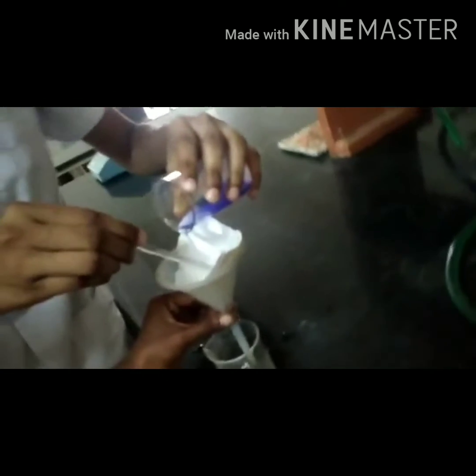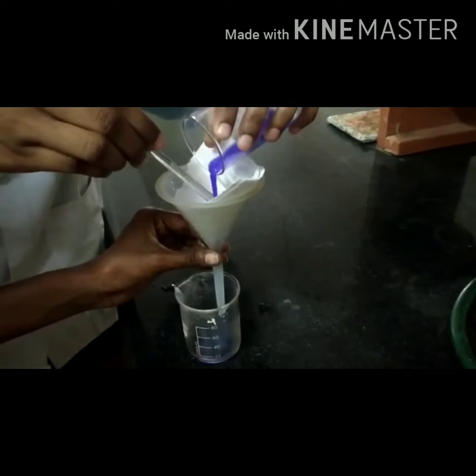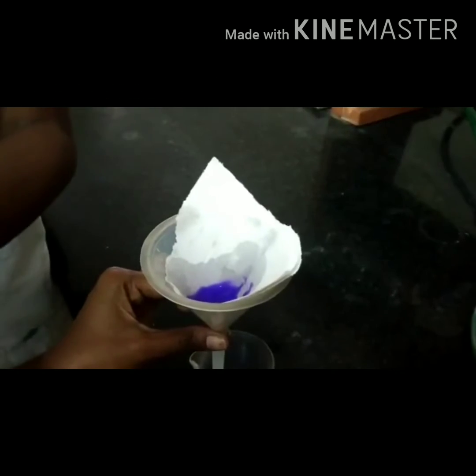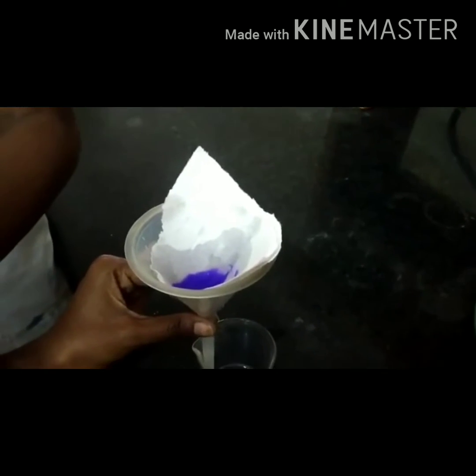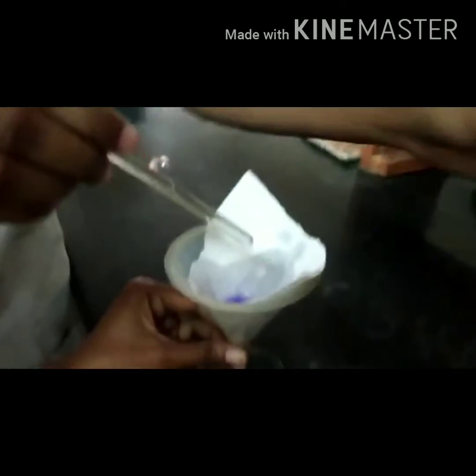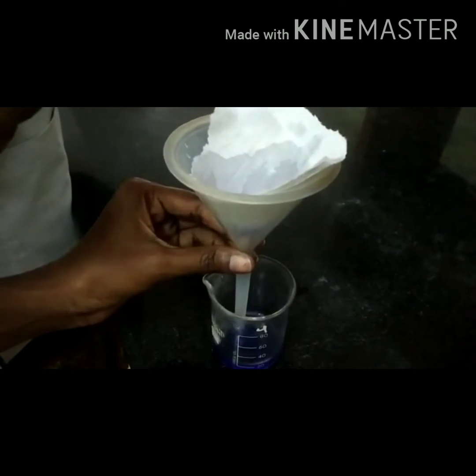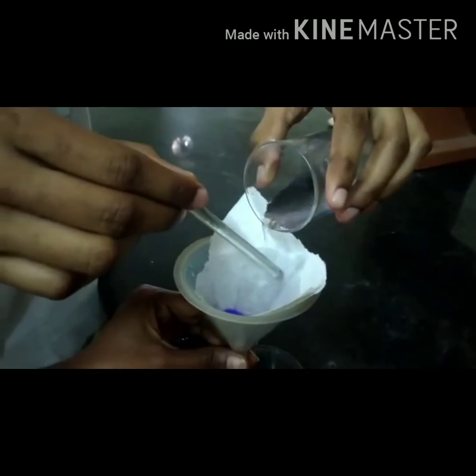If violet crystals of hexaammine nickel(II) chloride have not formed, try initiating crystallization by gently scratching the sides of the beaker using a glass rod. Filter the solution, wash the crystals with concentrated ammonia solution, and dry the crystals by placing them between pieces of filter paper.